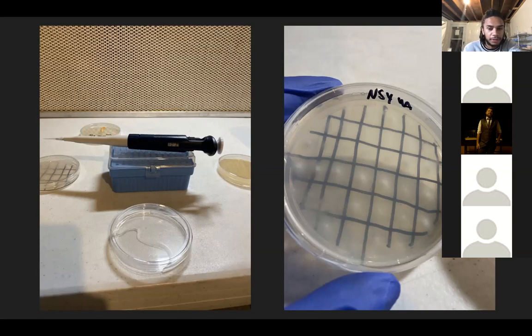First go like 100 or 200 microliters, and squirt all of that water onto the spores on the petri dish, and then shake your petri dish around. And then switch it down to like 10 microliters and suck up that water off the top. And then put one little drip of water in each part of the grid.